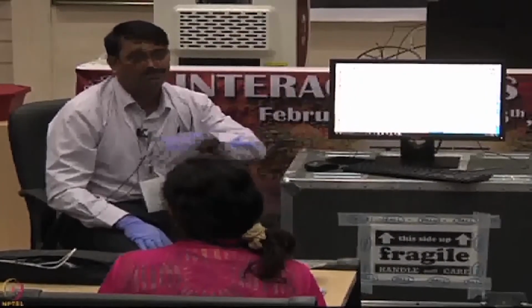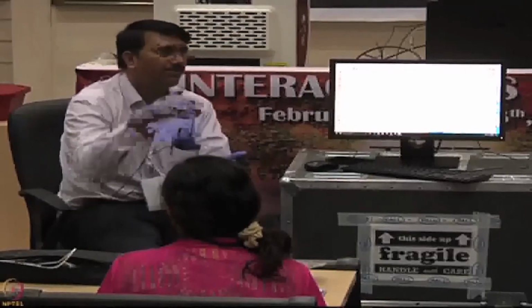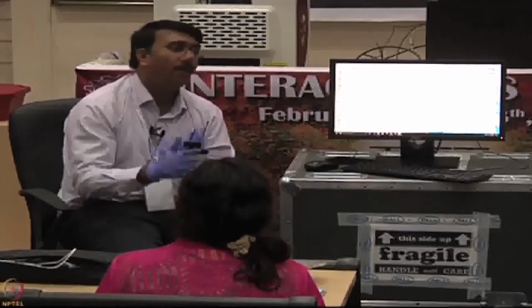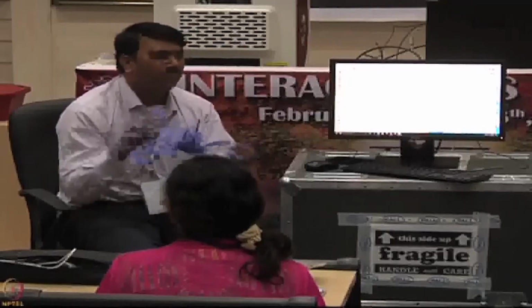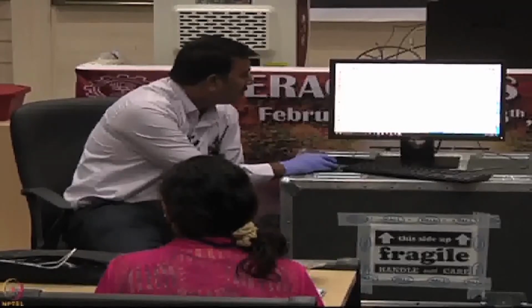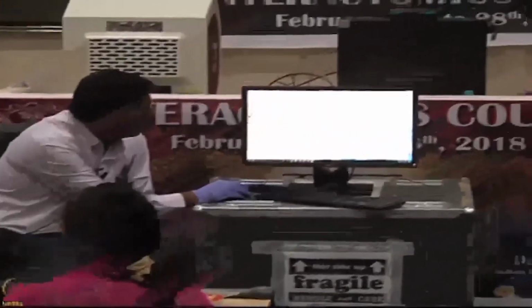During the hydration time, whether your sample plate has to be in the shaking condition. I mentioned it is not fluidics based, it works on the dip and read. Generally not. What happens is, during the waiting period if you are shaking, proteins have a tendency to aggregate. Generally we do not advise that. Okay, then I will uncheck this. During only experiments we require shaking. During hydration not required.